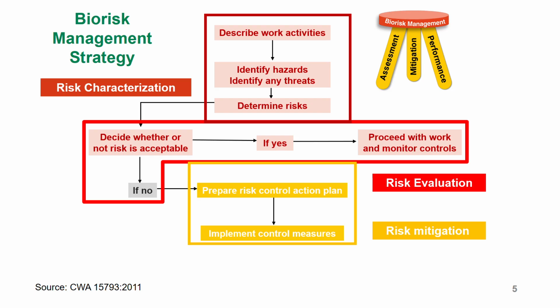So now what happens after you've implemented your risk control plan? Do you just wait and leave everything to chance and you don't even check whether or not that biosafety cabinet, which cost you a lot of money, or that renovation that you did, which also cost you a lot of money, are actually working? Do you just sit and wait and hope for the best?